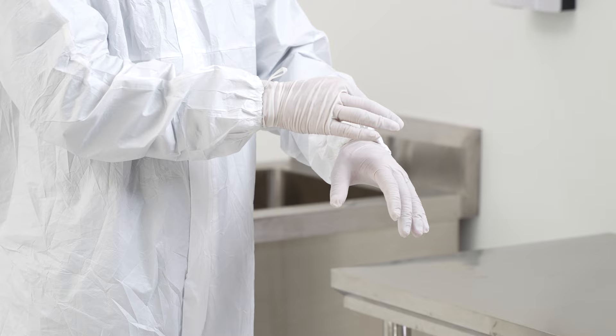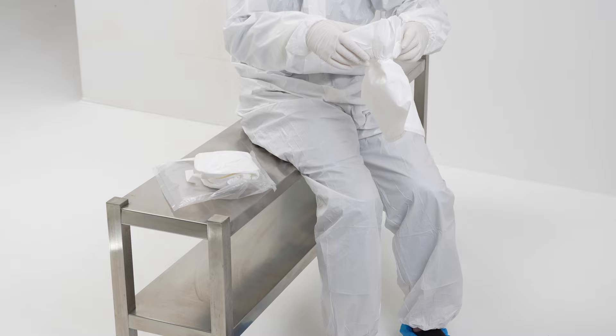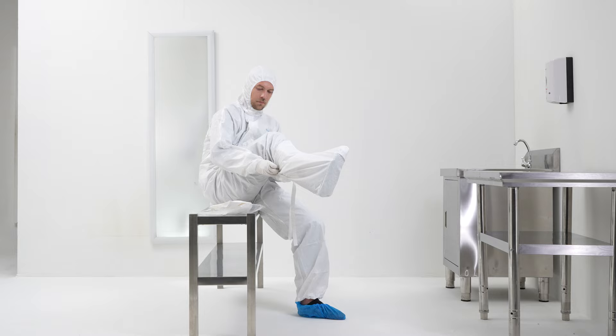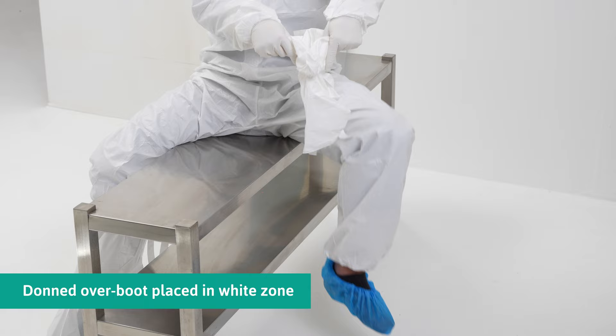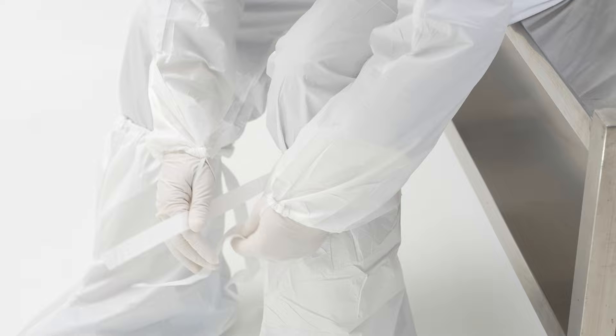Insert thumbs into thumb loops. Pull the over boot over the foot. If a crossover bench is used, transfer each leg to the white zone as the over boot is donned. Repeat for the other foot, then fasten the tie strap for a secure fit to the leg.